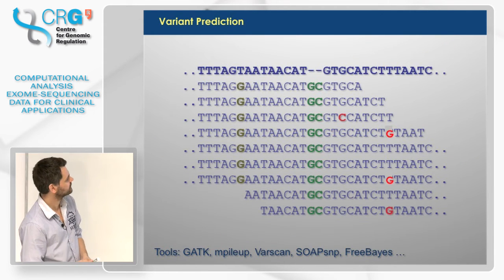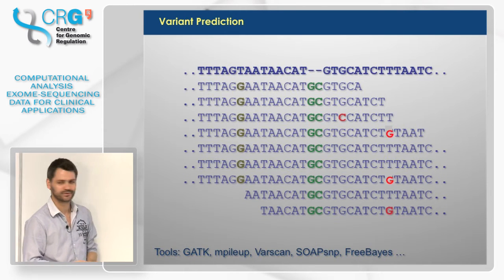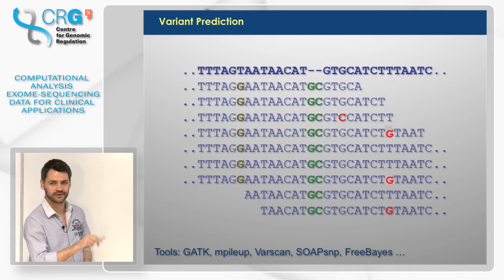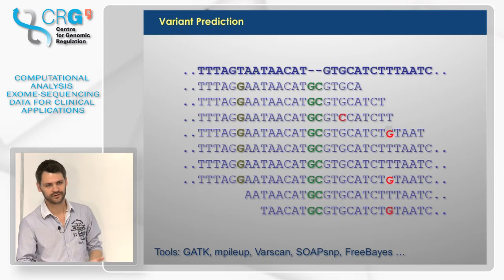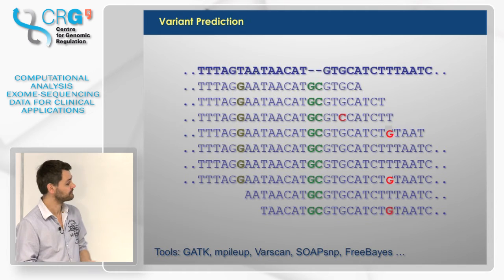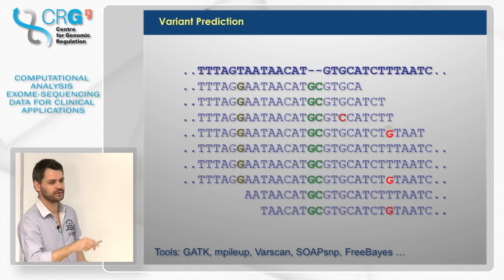Then we went to the SNP calling. In that case, we used a two-step calling approach. We first used MPileup to calculate on each position the total counts. So MPileup came from the first position of chromosome 1, took it and just counted how many T's it sees, and how many reference nucleotides and how many non-reference nucleotides. And it did that for each position and created a so-called pileup file. So the pileup doesn't really decide if there's a SNP or not. It just gives you the numbers.